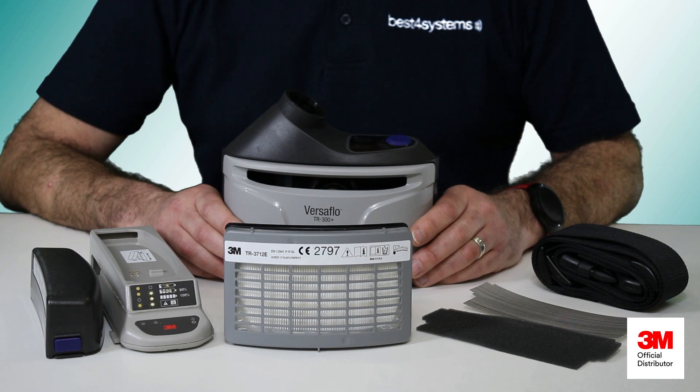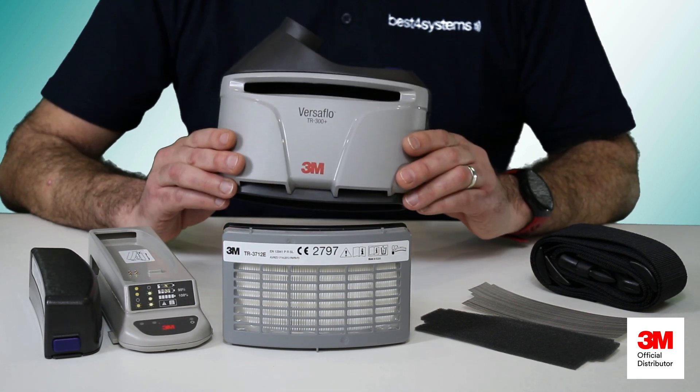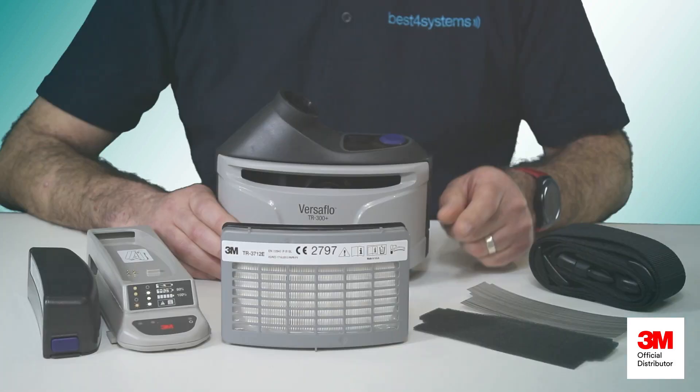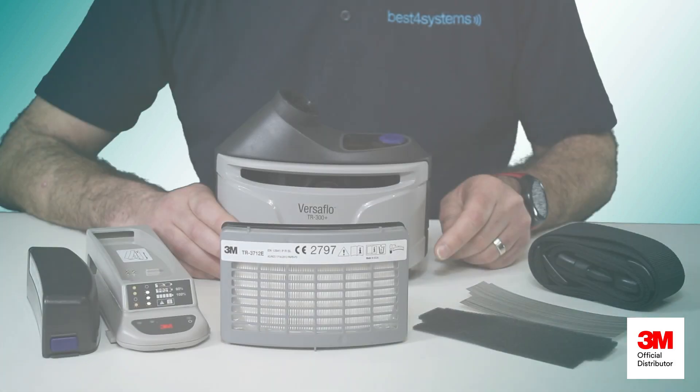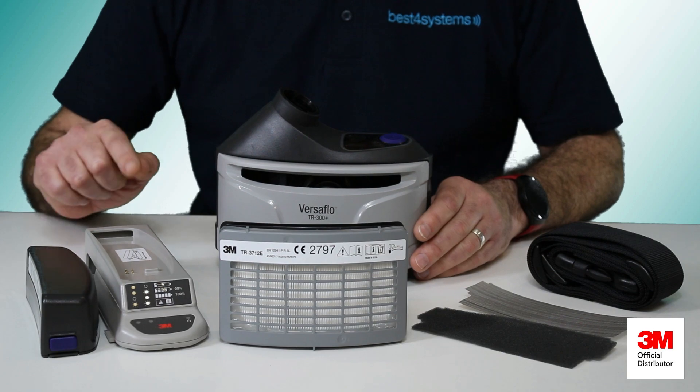As you can see in front of me, you have everything you need: the powered air unit, a P3 particle filter, a pre-filter, a spark arrestor, belt, a long life battery, and a charger.